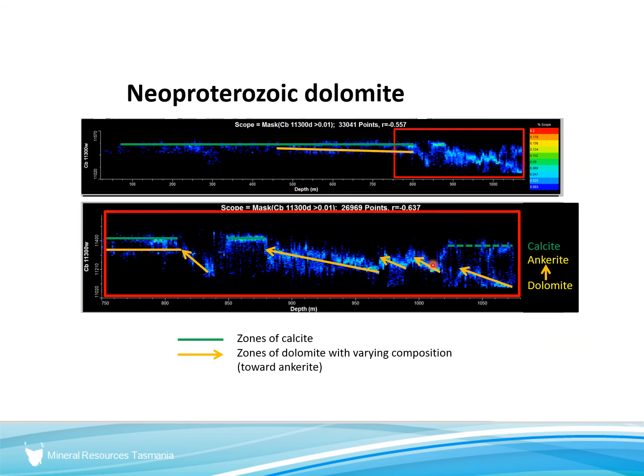If we look closer, down here we can see gradations in composition which are indicating either alteration or the protolith carbonate variations in it, showing us probably original reef sequences.